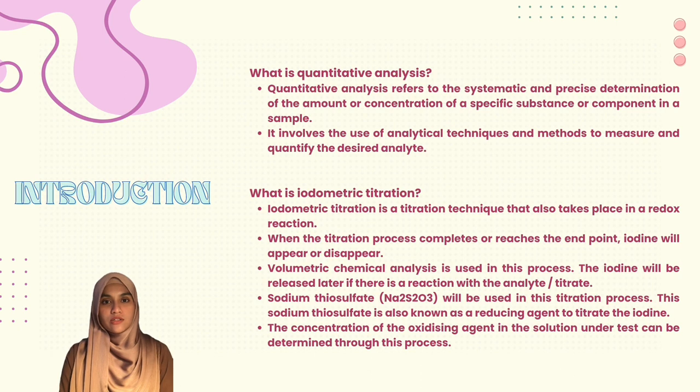First of all, I will talk about the introduction of our group project, which is about the quantitative analysis of caffeine concentration in pharmaceutical formulation using titration method. Quantitative analysis refers to the systematic and precise determination of the amount or concentration of a specific substance or component in a sample. It involves the use of analytical techniques and methods to measure and quantify the desired analyte. Various methods have been developed to quantitatively determine caffeine in pharmaceutical formulations.